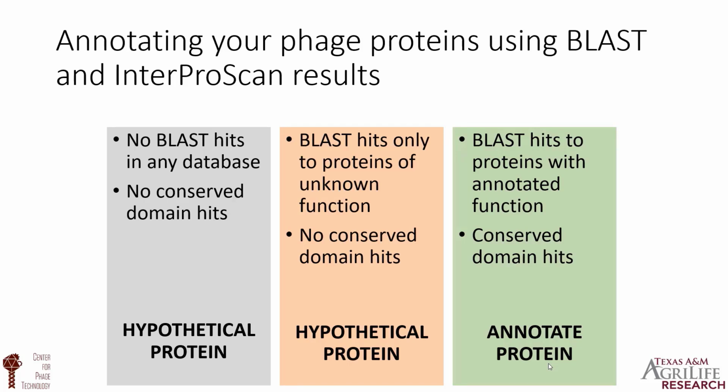Annotating your phage proteins using BLAST and InterPro results, you're going to have a mixture of hypothetical proteins and annotatable proteins. Proteins that have no BLAST hits in any databases and have no conserved domain hits will be annotated as hypothetical proteins. If your protein only has BLAST hits to proteins of unknown function and no other conserved domains, this will also be annotated as a hypothetical protein.